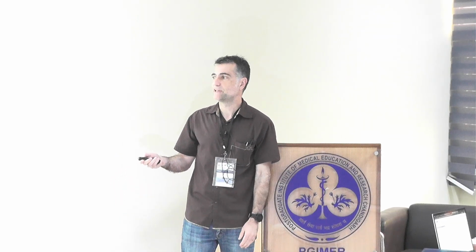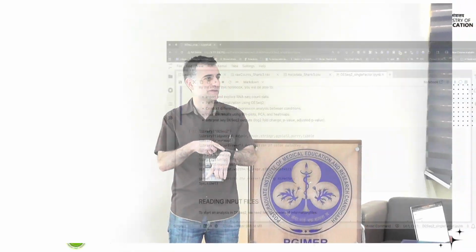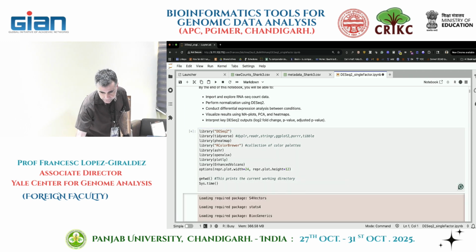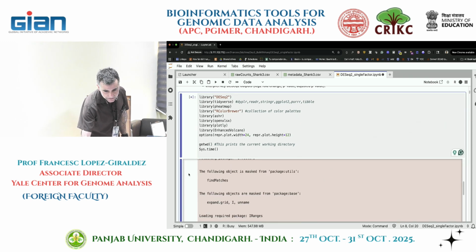Well, I'm telling you what this line does, and the only thing it does is tell me the time of the day. That's it. So, like the other days, the only thing we need to do is just execute it. So you can do it. Don't wait for me. You're going to get a bunch of warnings.